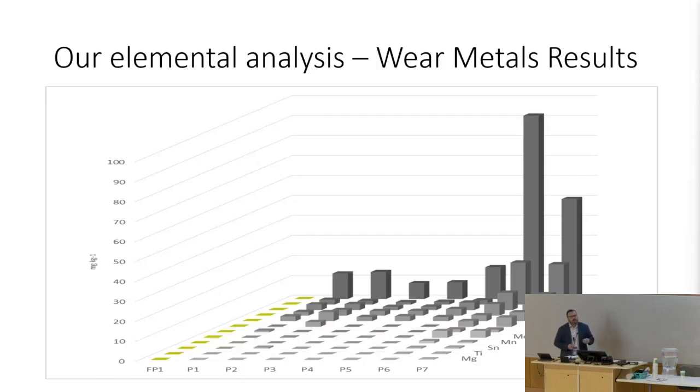We do see some elements that could potentially be problematic for people handling the oils, like increases in cadmium. But we don't know anything about the species of these elements at this point. When we look at our jet and turboprop oils, we also see some wear elements, but much less. There's no piston in a cylinder, so less friction. But we still see things like molybdenum that are associated with the superalloys.